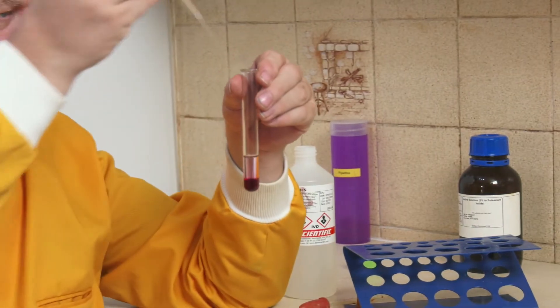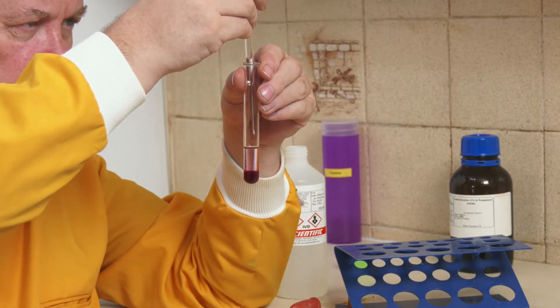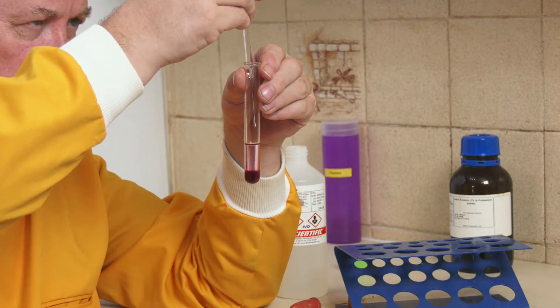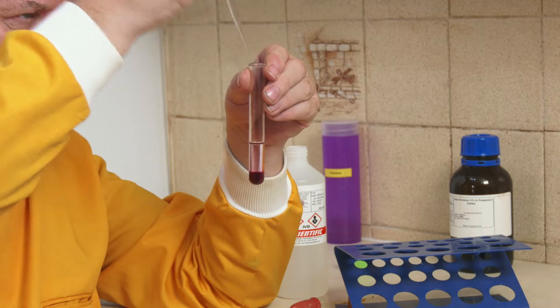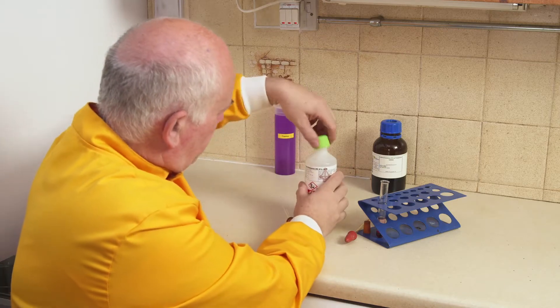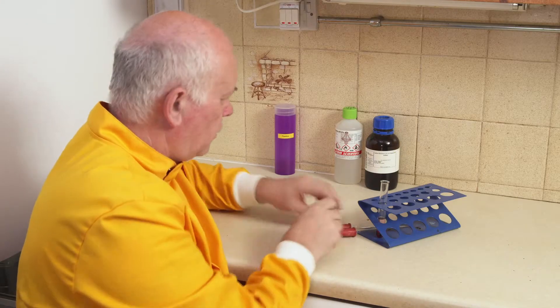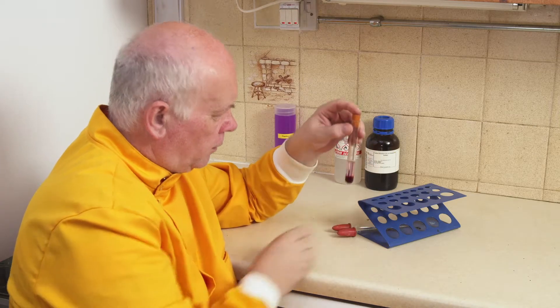I'll put a little bit more cyclohexane in. I'll try to be very gentle as I do it. There, I've done that. I'll put the lid on because it's a rather obnoxious smelling liquid which you fortunately can't smell. I've got a little stopper and I'll put the bung in the top.